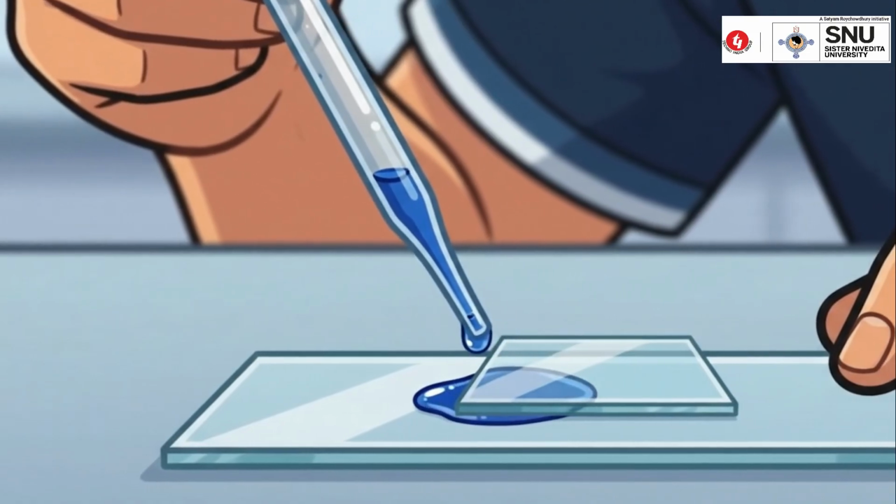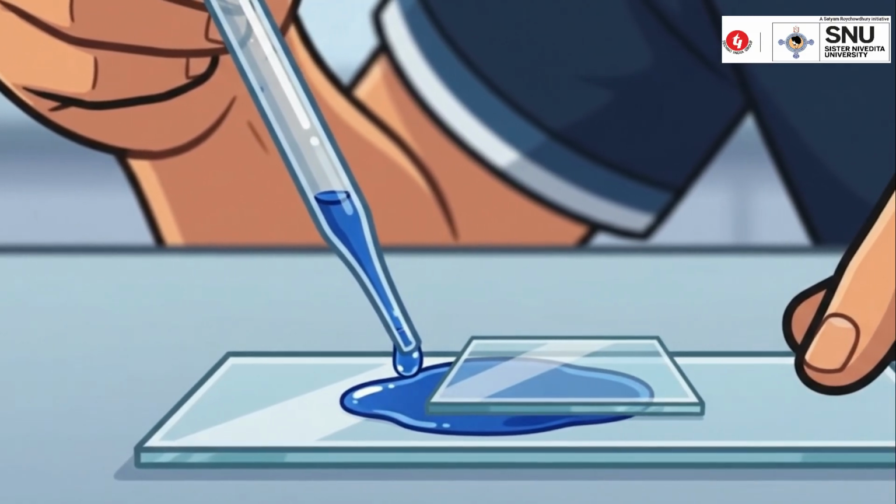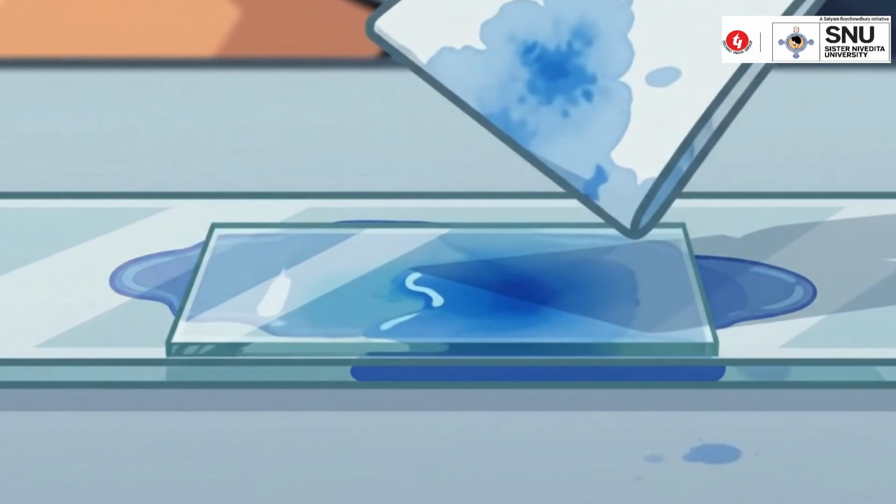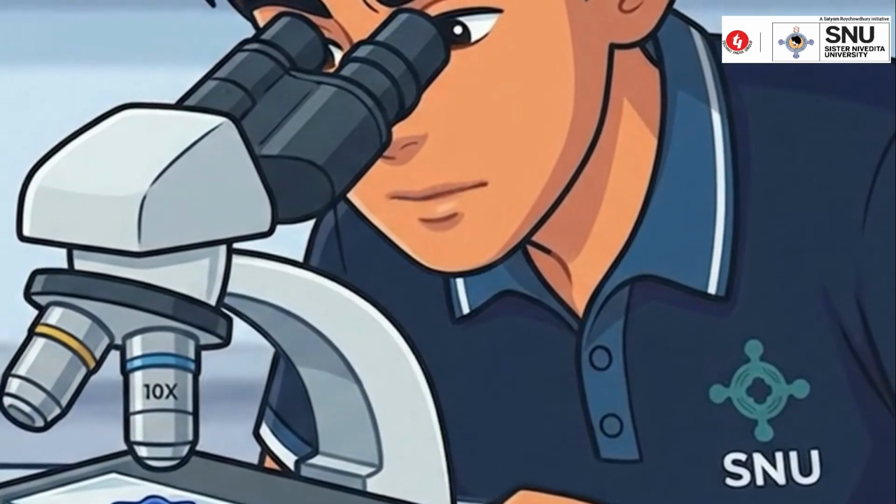Now add methylene blue stain to the sample and wait for a few seconds. If needed, remove the excess stain. Try to avoid the air bubbles. Now we will see it under the microscope.